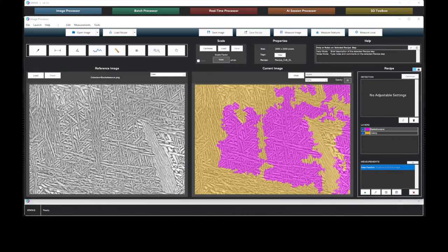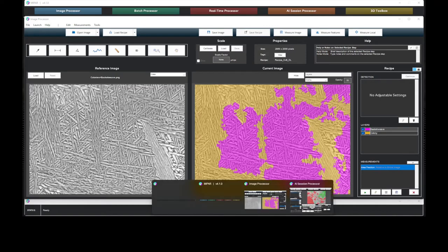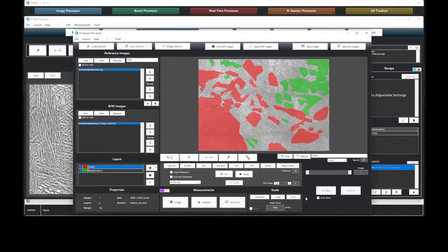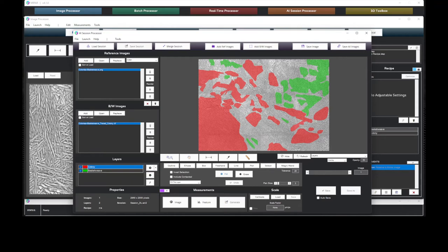Now, let's quickly take a look at the training setup for this model. The operator simply highlighted some regions of the colony and basket weave microstructures. We can see that even with some quick annotations, our artificial intelligence trainer is capable of achieving some amazing results.